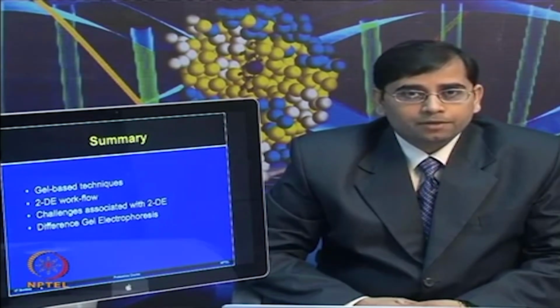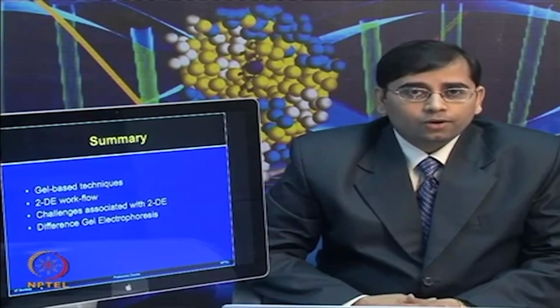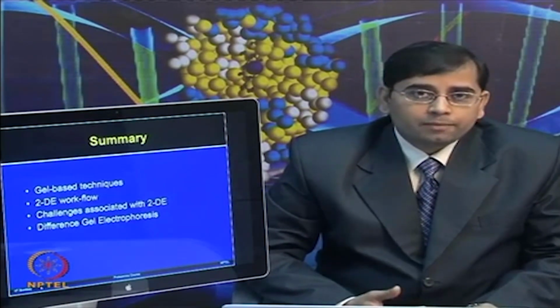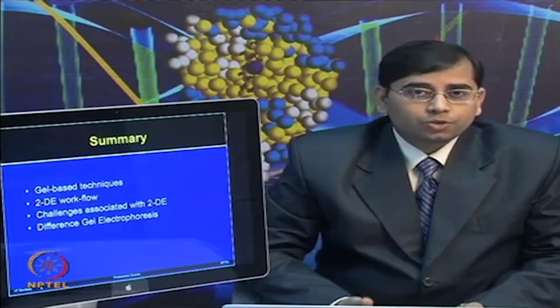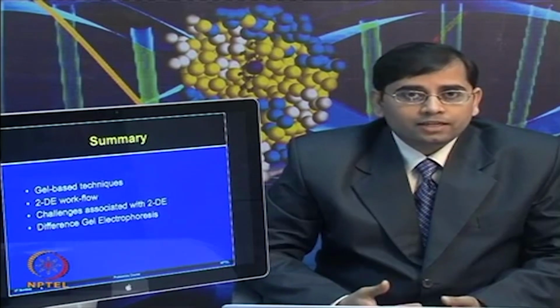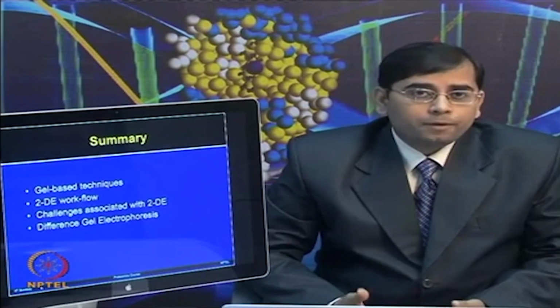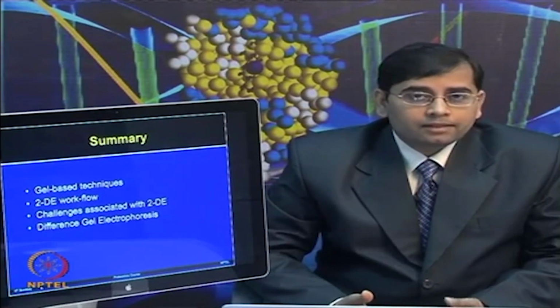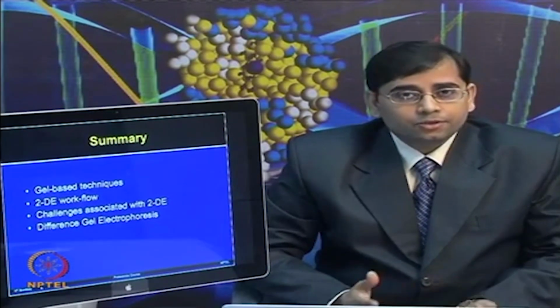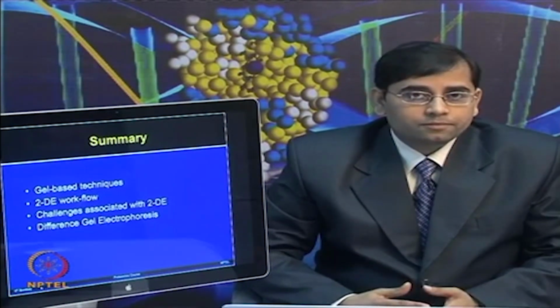I hope that at the end of this module you will be able to perform gel based proteomics experiments, but please keep in mind these protocols and methods only give you a feel for performing these experiments. Each experiment, each sample type, each biological question brings its own unique challenges, and depending upon those conditions and your sample type, you need to optimize these methods. There is no one technology which can answer all of your questions, but it is a good idea to know what different methods are available for you to use.